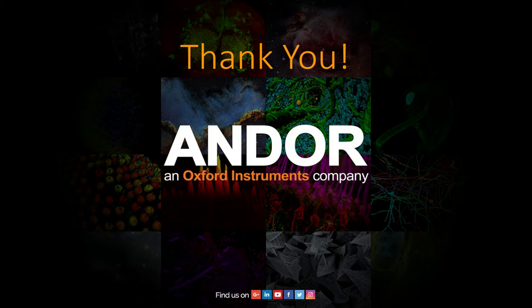Thank you, Dr. Castillo. Dr. Florindo, let's come back over to you. And this is a few parts here. From the photo manipulation tools presented, I would like to ask, one, can they be combined with the DRAGONFLY? And two, what are the main differences between mosaic and micropoint?